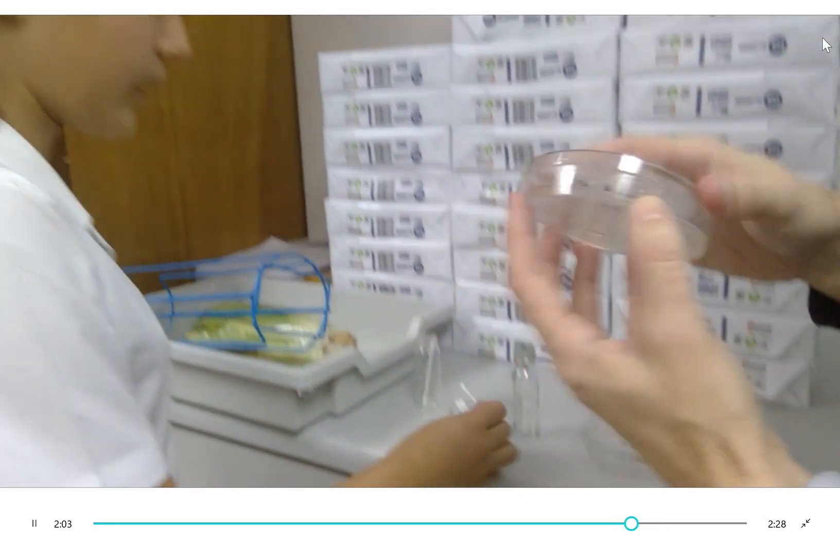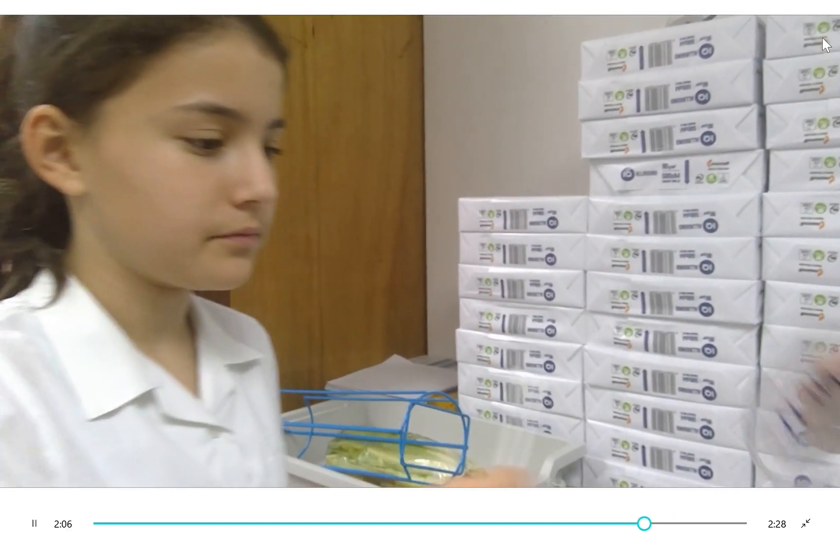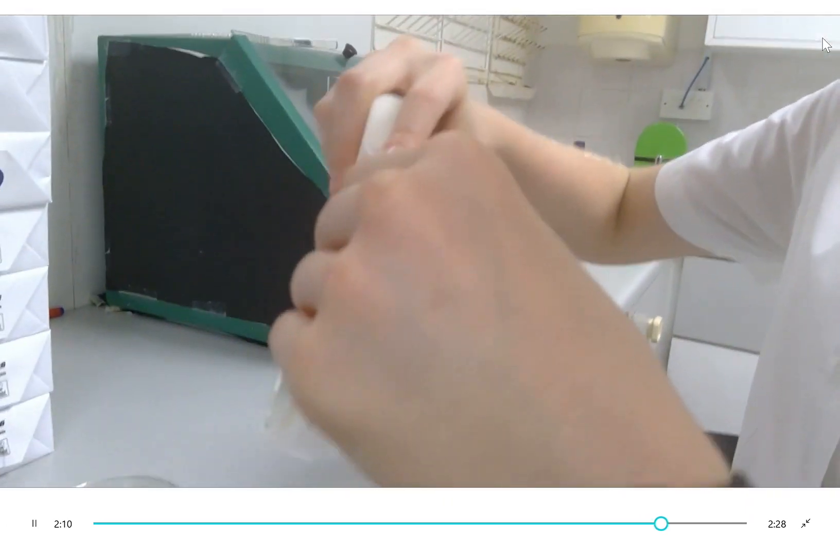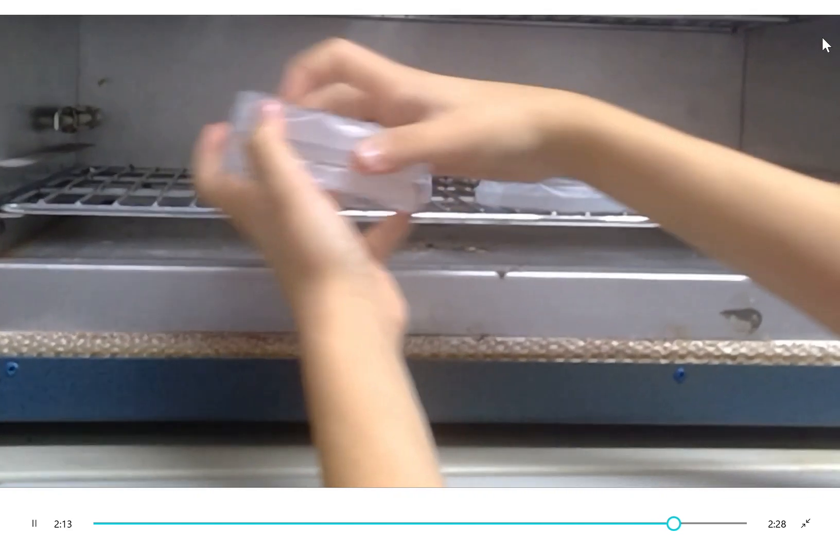We swabbed bacteria from our mouths and placed it into our petri dishes, sealing them in order to block out any excess bacteria. We then placed them upside down in an incubator at a temperature of 25 degrees Celsius.